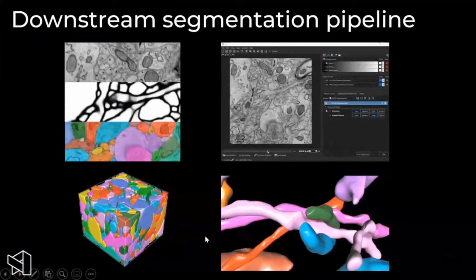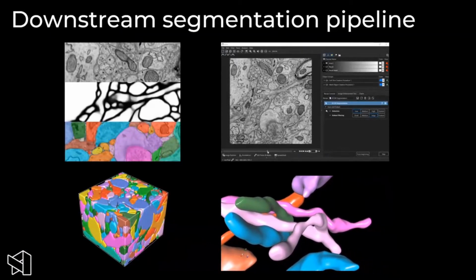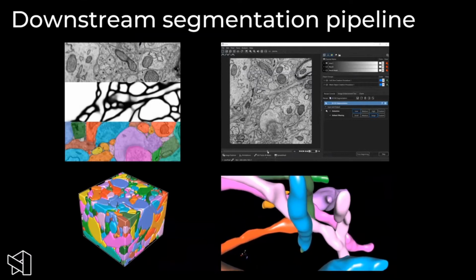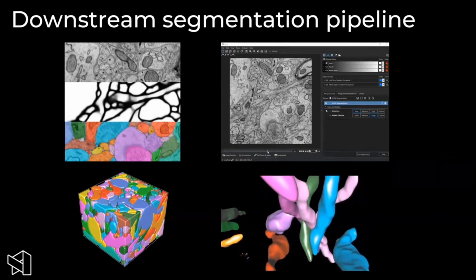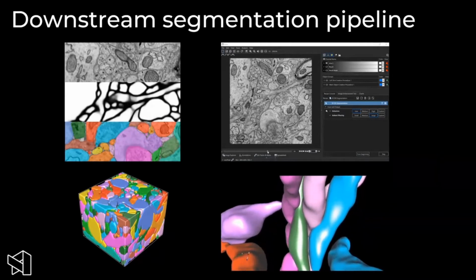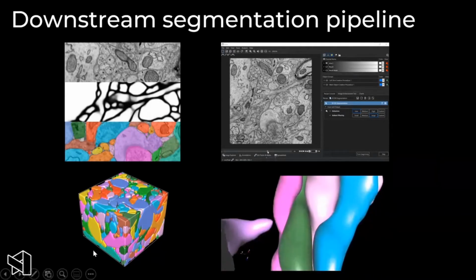And this is a kind of segmentation that you can get from that. Definitely very powerful and relatively easy to use now that we've done a lot of troubleshooting to set up the whole infrastructure. We use a lot of the standard tools, and we've done a lot of customization as well to make sure that things work as easily as possible.